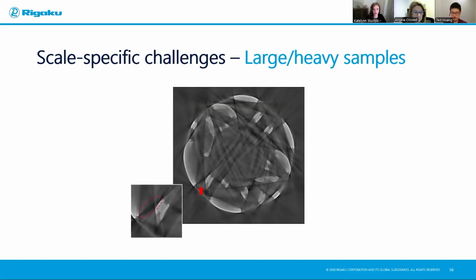to highlight what I'm mentioning about, you have a very high absorption sample. When you scan it from one direction, your X-ray travels like this, right? But if other parts of the sample get in the way, like for example here, a lot of the X-rays are already gone before reaching the larger part of this scan I was mentioning about. So you have kind of like a shadowed area that's having less information reaching your detector.